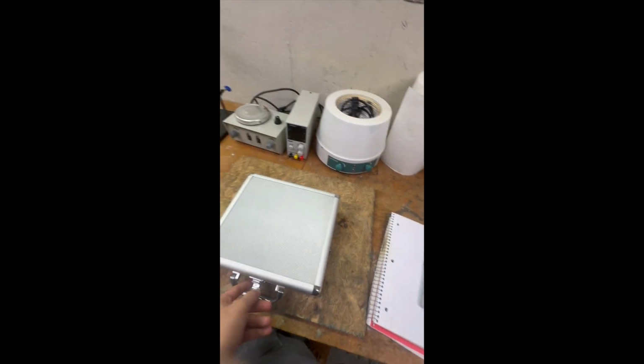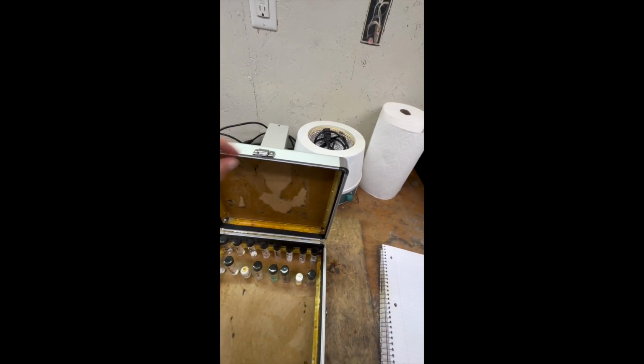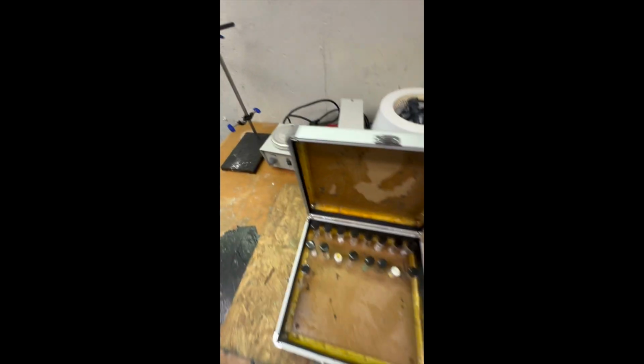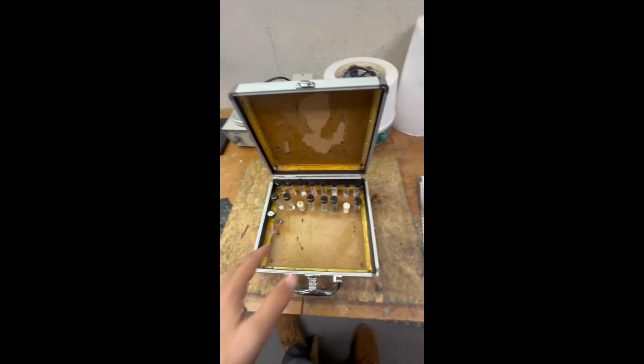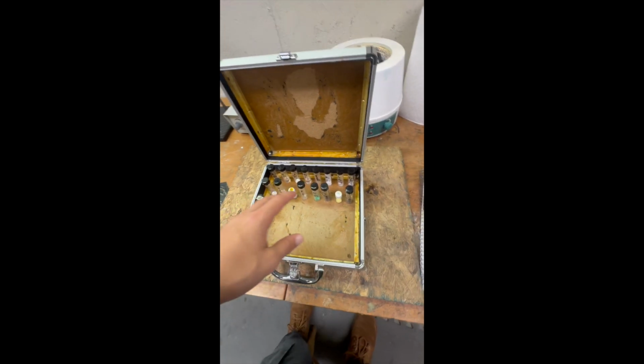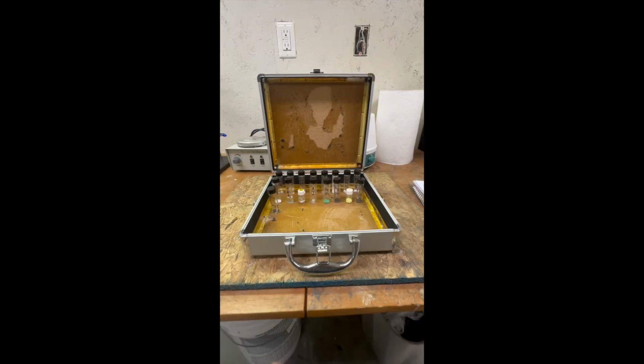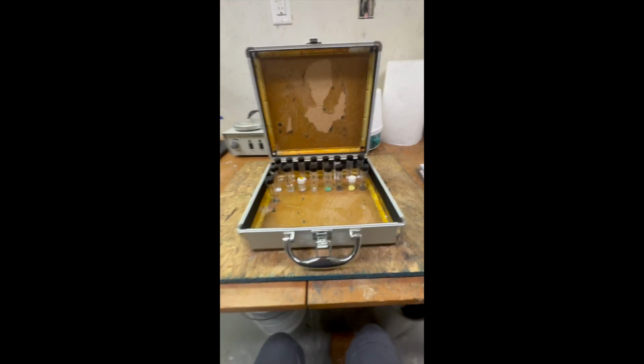Anytime I do an experiment, I take a bit of the chemical that I either made or used, and I put it in a little vial. If it's dangerous, I dilute it, and I glue it down, and it's just used for me to remember all the experiments. So I wanted to show that.